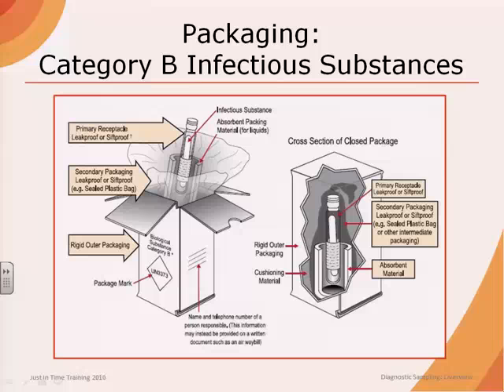Place the secondary container in an approved, insulated, waterproof, flexible or rigid shipping container. Place ice packs inside the shipping container. Place case histories and submission forms in a sealed plastic envelope inside the shipping container. Seal the shipping container. Ensure the appropriate package marks are on the outside of the shipping container, and then ship.